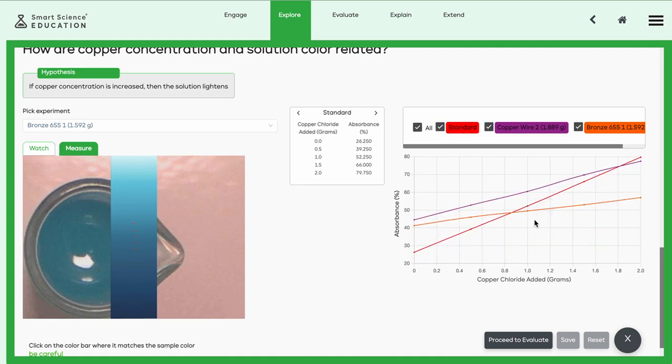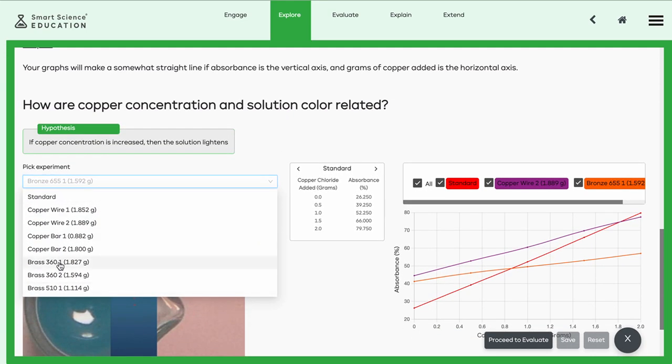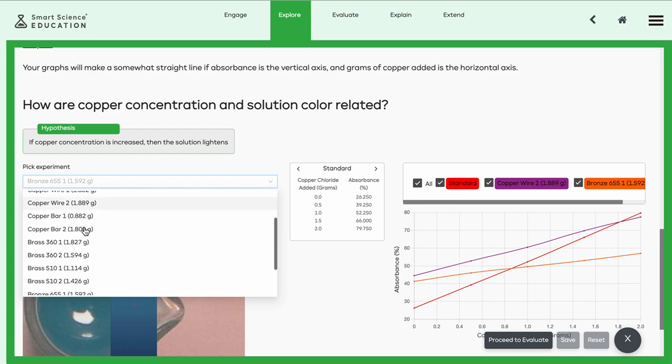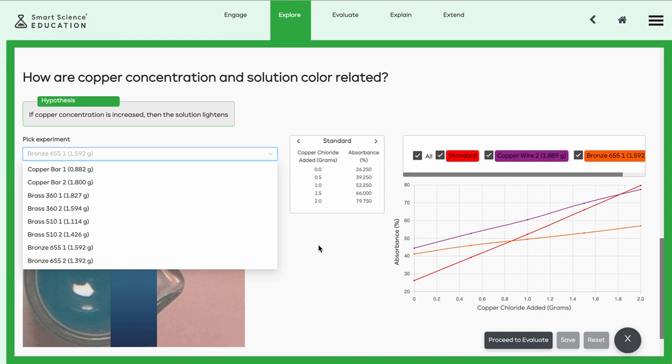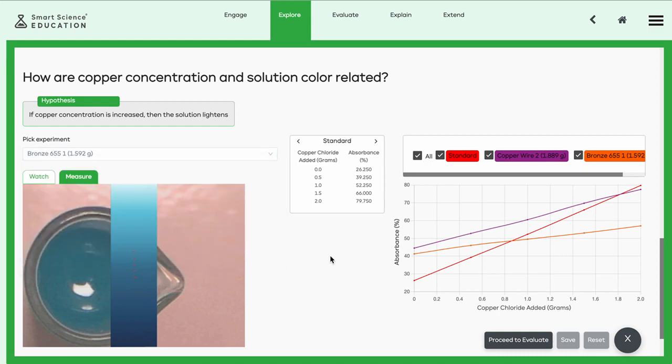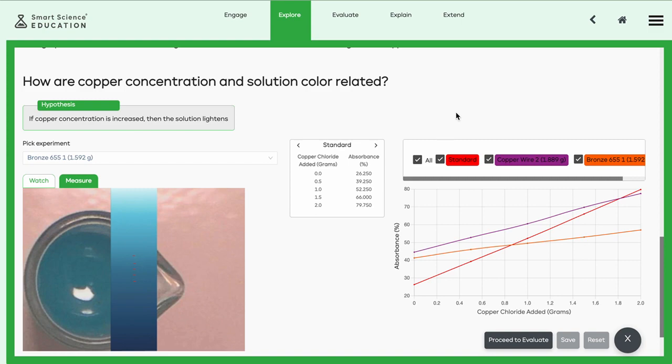And again, I've just done a pretty rough job of measuring. You may be a lot more careful than I was, but essentially you're going to go through and do all 11 of these videos measuring the different color changes, and therefore using some of that math up above and some of the knowledge you have of chemistry, trying to estimate, determine the amount of copper in solution. Hopefully you'll learn a lot from this video and doing this lab about colorimetric determination of copper.